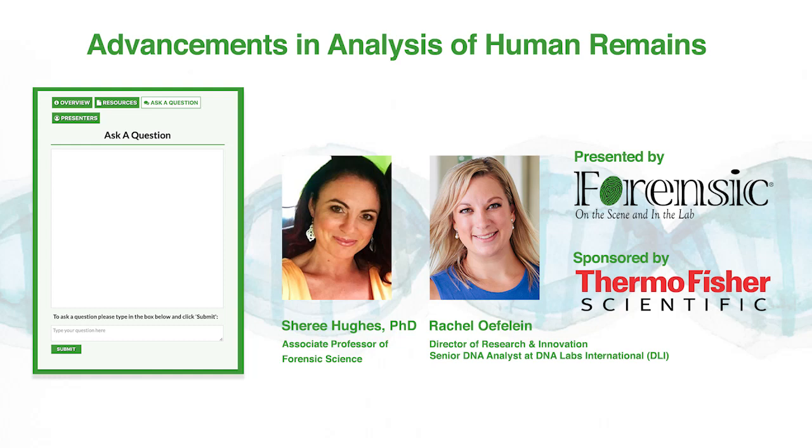Is it possible to know how old the bones you're treating are? A lot of times with the bones, you have to go off of the information that's been provided to you by the investigator, but you can also tell visually. I will say a caveat to that is that a lot of times bone samples could be a really fresh sample, but maybe it's been exposed to very harsh conditions, so it can give the appearance of being older. When in doubt, it depends on how much sample you have, but if you're concerned about your quality, I maybe wouldn't go straight to rapid at that point, unless you have plenty of sample to work with. You could always try rapid and then move on to a demineralization, followed by an organic maybe to clean that up if need be.